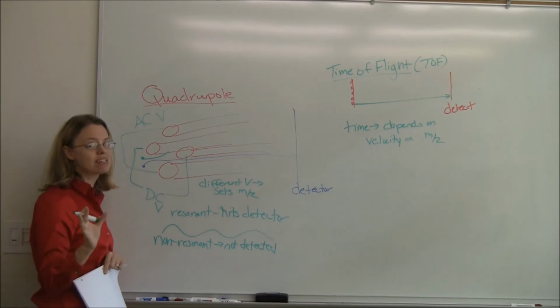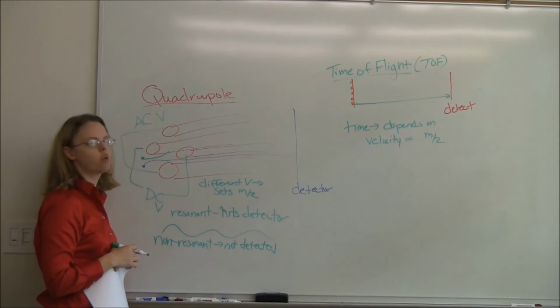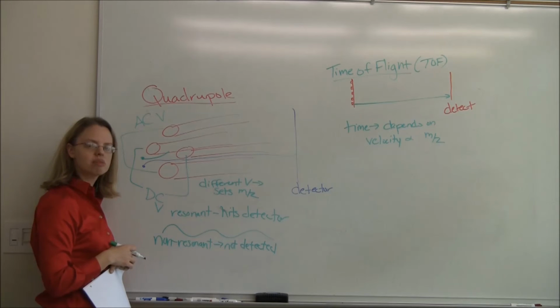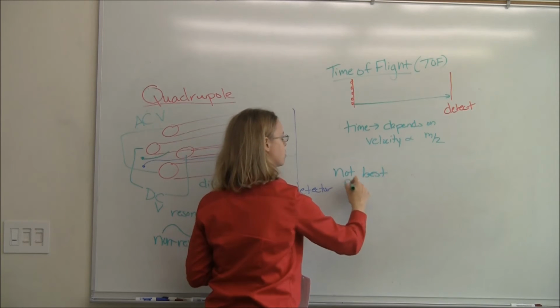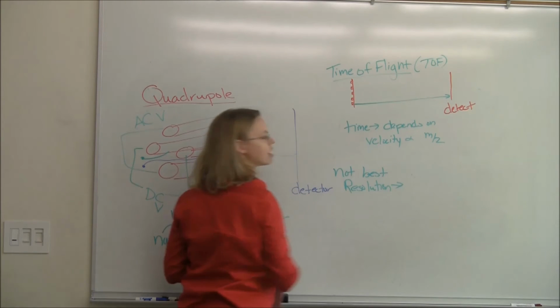So both of our mass specs in our lab, we have a GCMS and an LCMS. Both of them have a quadrupole. It's a really pretty cheap detector. It's pretty rugged, but there are some limitations to it. It's really not the best for resolution. So we don't have high resolution mass spectrometry, sorry, not in your second year level lab.